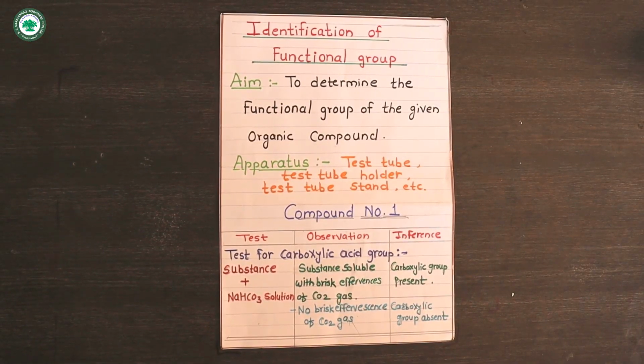Myself, Phopase SE from the Department of Chemistry, RBNB College, Sri Rampur. Today, we are going to perform the next practical, identification of functional group.